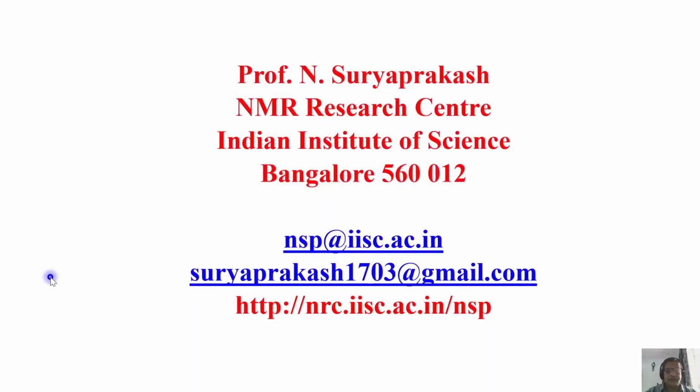In the last two classes, or even three classes I would say, we discussed a lot about multi-dimensional NMR, focusing mainly on two-dimensional techniques, and explained to you the time dependence, choosing the dimensionality, what is the advantage of different two-dimensional experiments, what type of experiment you have to choose, and what is the polarization transfer mechanism for some of the pulse sequences like INEPT, TOCSY, ROESY, etc. A number of pulse sequences which are commonly used, both homonuclear and heteronuclear, were discussed.